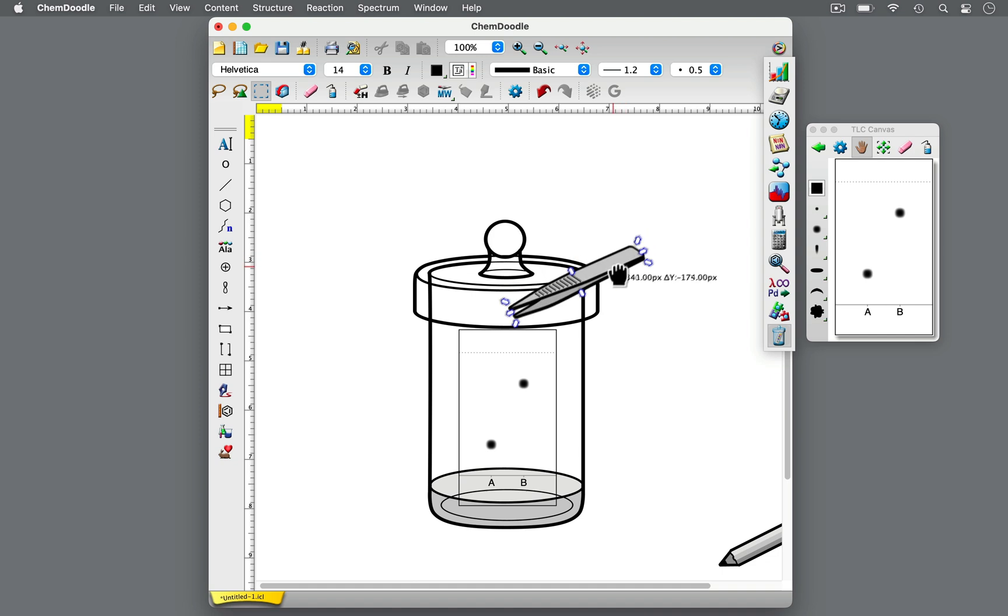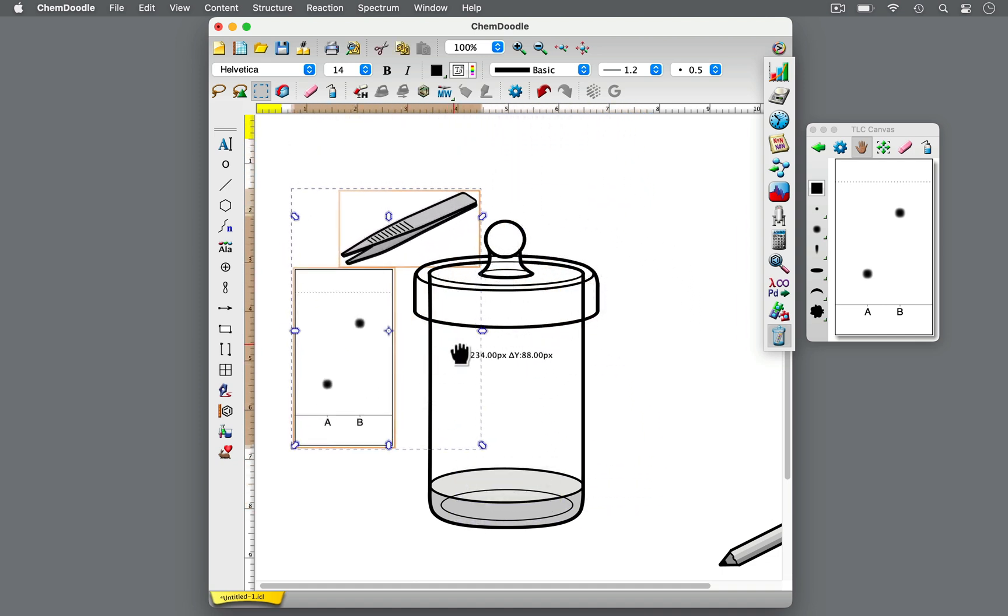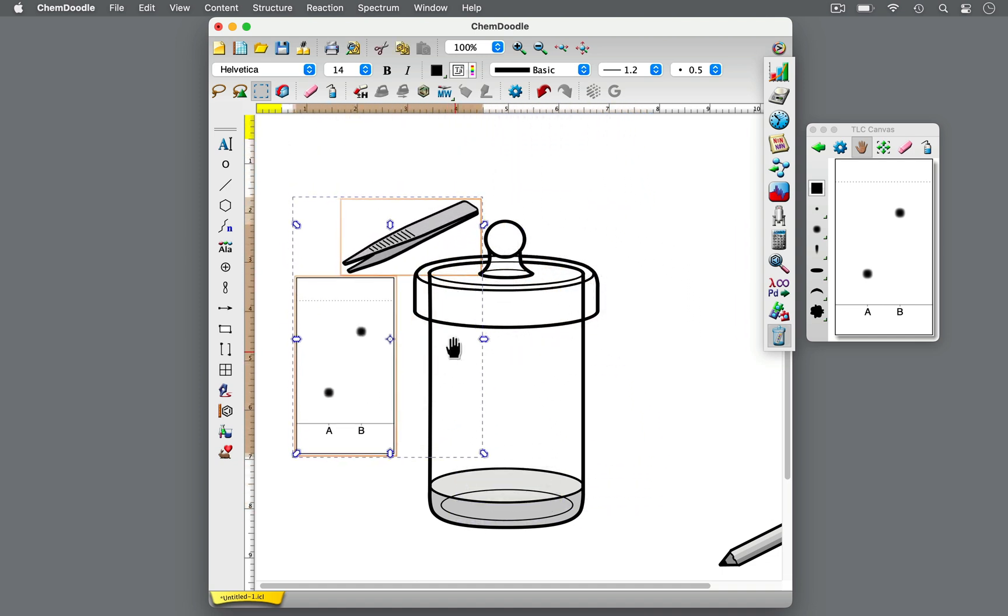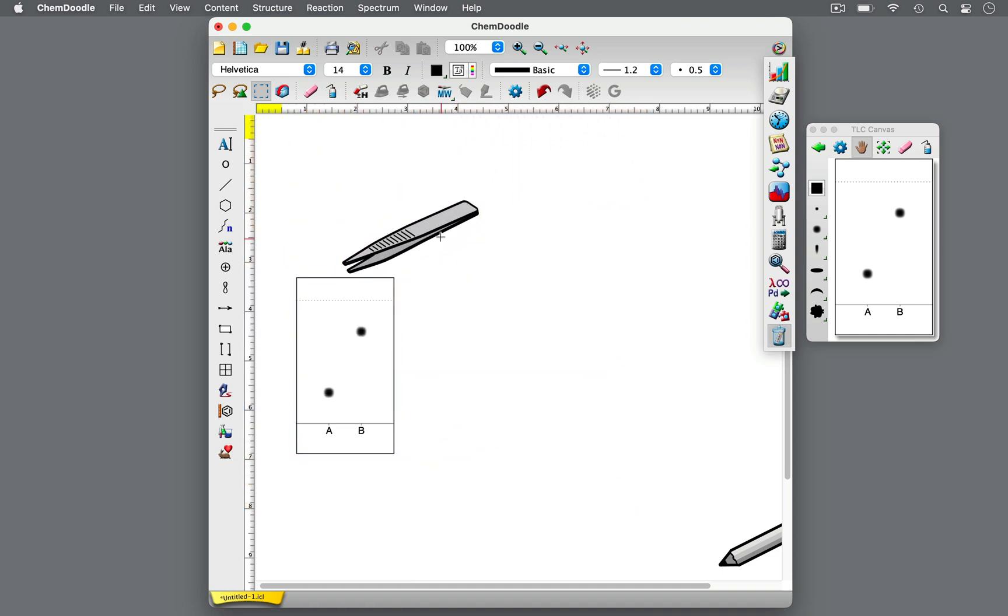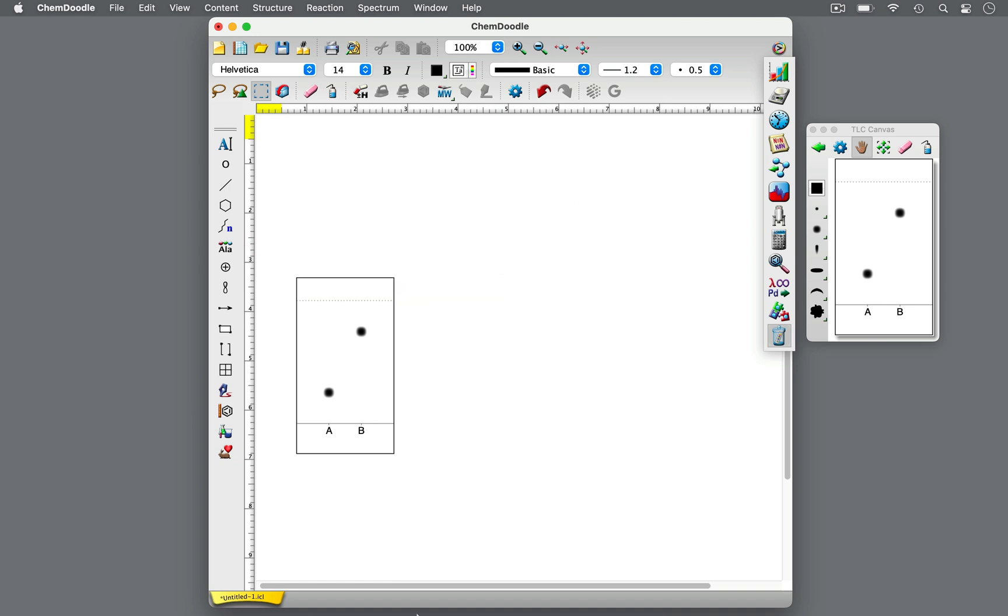When the solvent front is about 1 cm from the top edge, using forceps, remove the TLC plate from the developing chamber. Don't allow the solvent front to travel to the top edge of the TLC plate or beyond. Immediately mark the solvent front with a pencil before it fades and allow the TLC plate to dry completely.